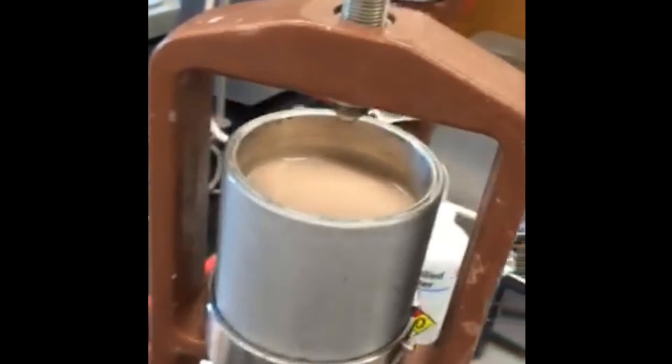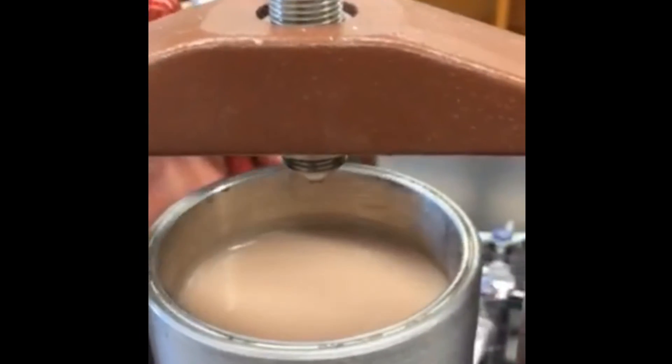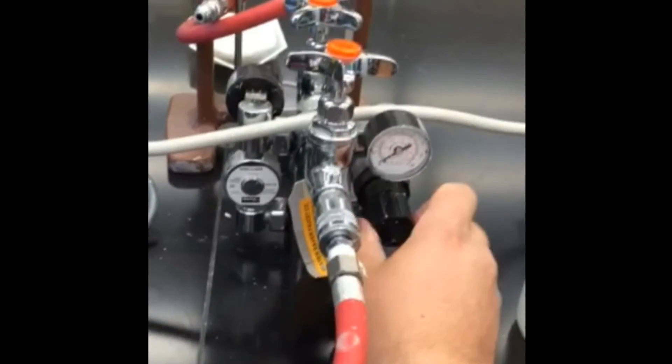Now what we have here is a filter press. If you can imagine a cup that's pressurized from the top — the cup is sealed except for a little pinhole on the very bottom. Through that pinhole, we place a filter paper over it, and then we pressurize the cup. There's a small amount of water that will leak through the pinhole.